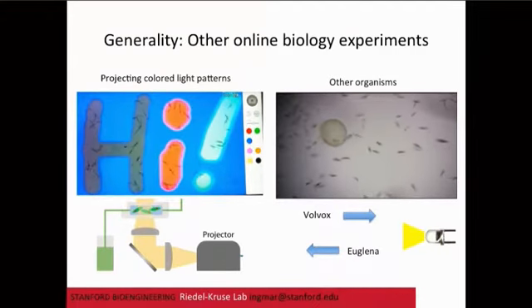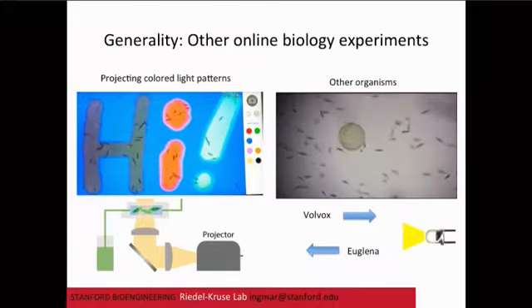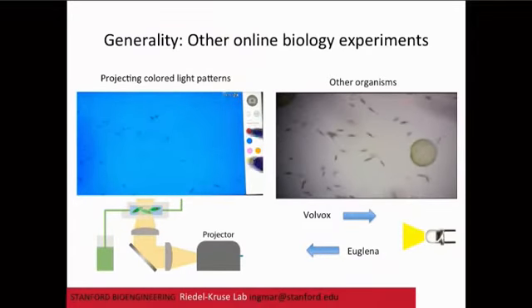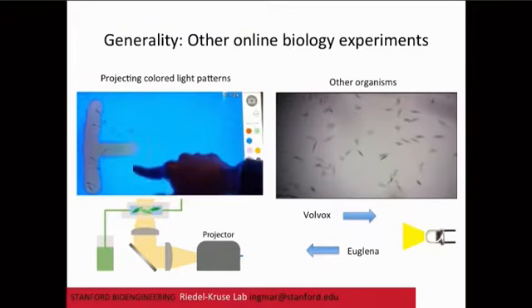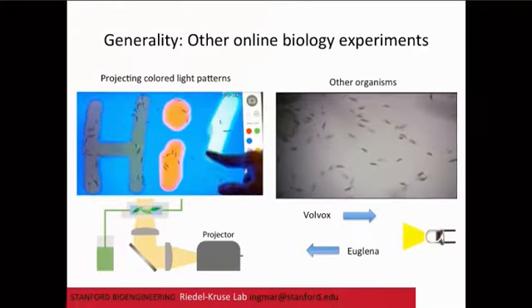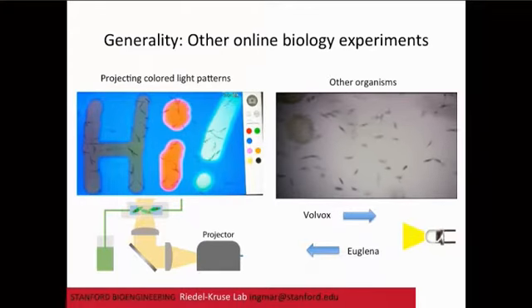One of the tricky things, if we want to bring these things stably online, is again the maintenance questions: which types of organisms lend themselves well to being robust and don't need too much logistics on our end in terms of maintenance.